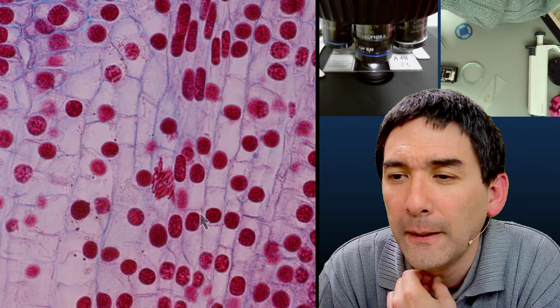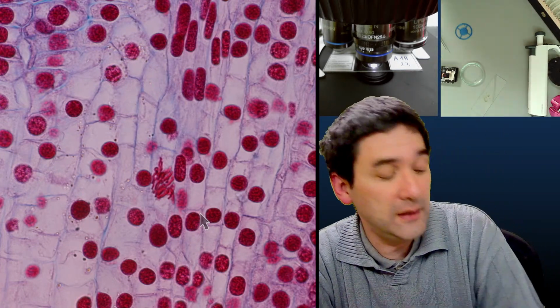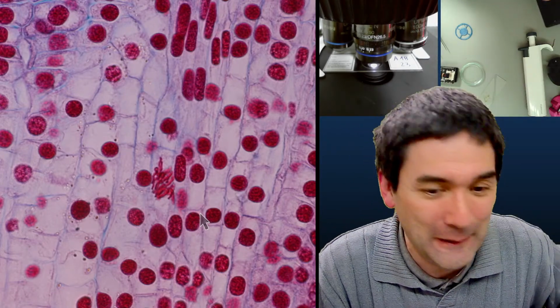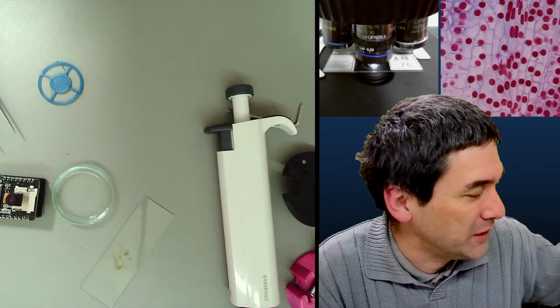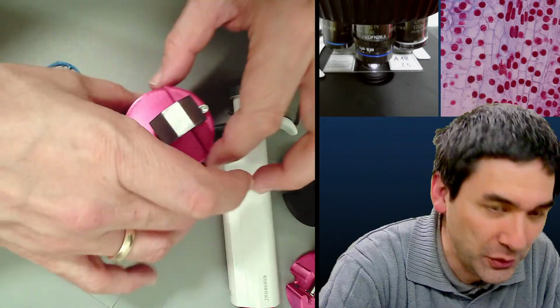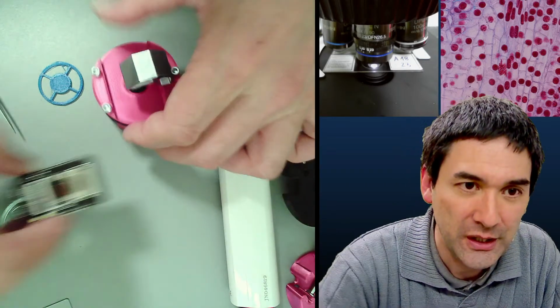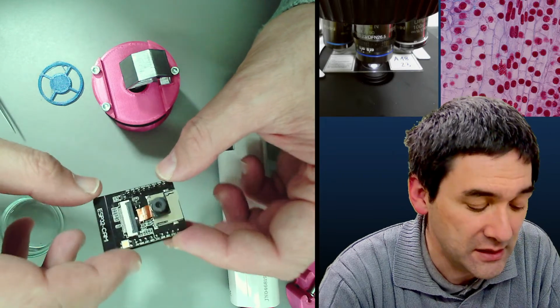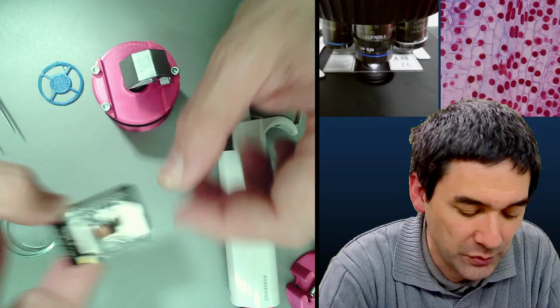Yeah. Okay. About 90 minutes of live stream now, 93 minutes. And I think I'm slowly starting to feel tired again. So if you joined in late, I just want to give a short summary of what I talked about today. I talked today about those little do-it-yourself microscopes using those standard cameras here, which I think are interesting bases also for experimentation, especially because they're so cheap. Okay, so that was number one.